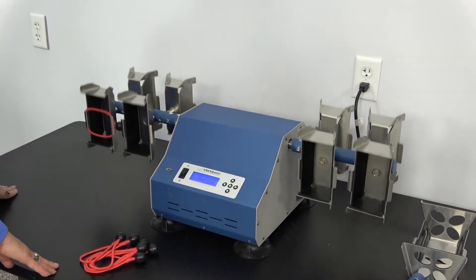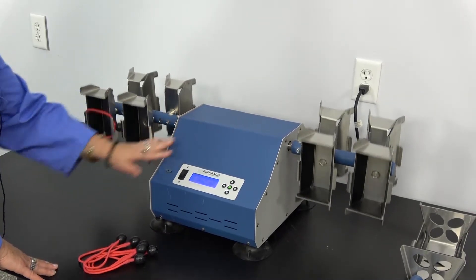That is at the max, and you can see that the unit itself remains quite stable.